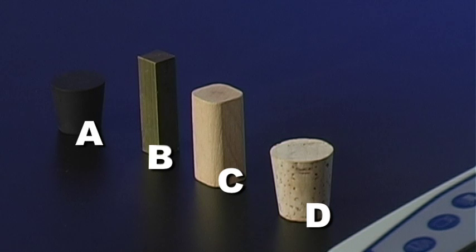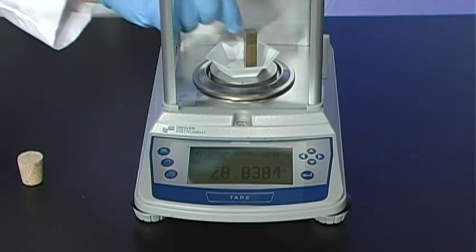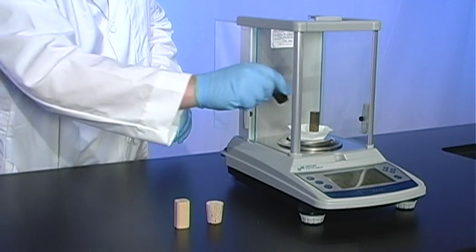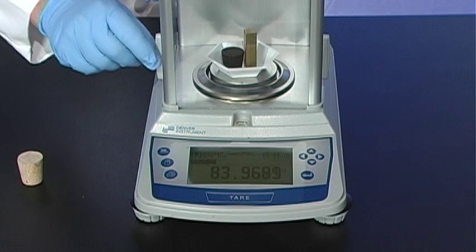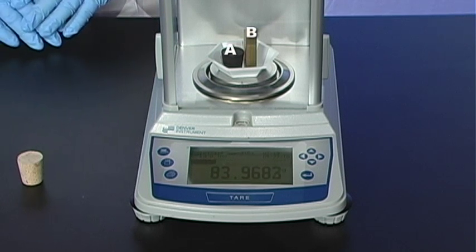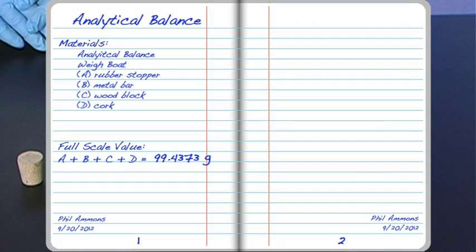Next, weigh items A and B together. The combined mass of items A and B is 83.9690 grams. Record this value in your lab notebook.